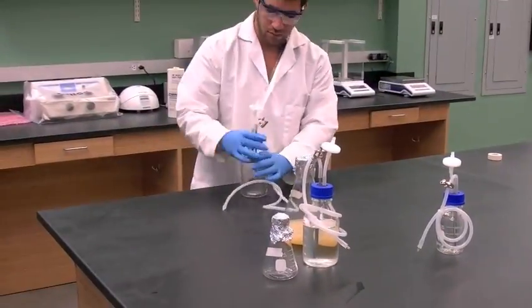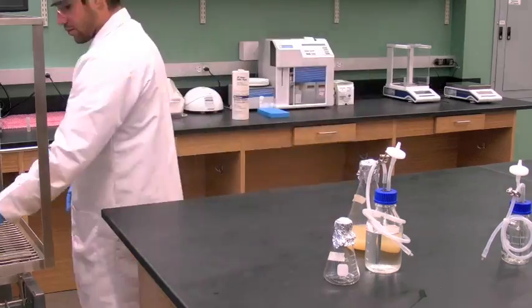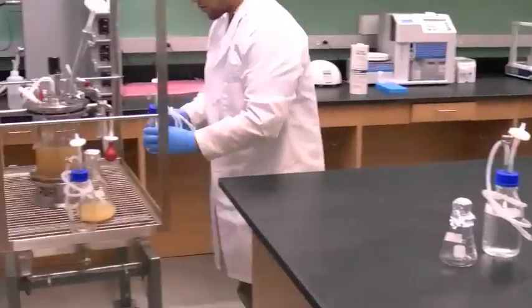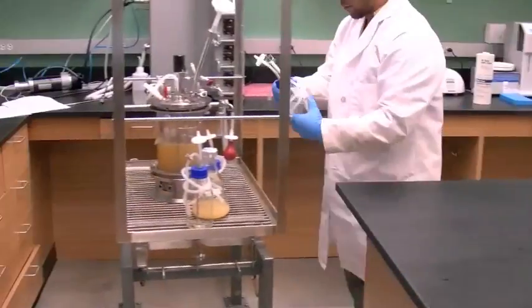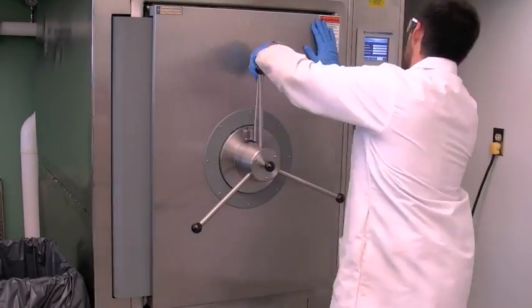Get autoclave cart. Set fermenter vessel upright on cart and all other solutions in plastic autoclave pans. Move the fermenter and solutions into the autoclave and the BRL using the cart.